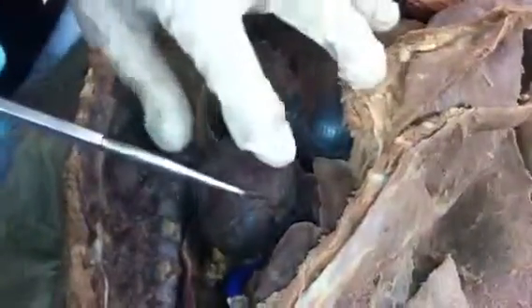I'm touching that. The pericardium. This one? No, we threw it away. Oh, it's the clear tissue, yeah. Clear connective tissue kind of thing that holds the heart together and protects it from other outside things that can hurt it. So we took it out. Pyloric sphincter.